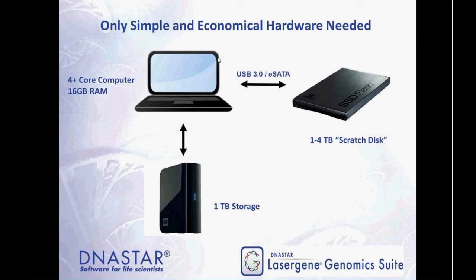Many customers opt for plugging in an external drive through USB 3 or eSATA. If you have an SSD drive, you get better performance. It reads data faster. So again, a computer like this might cost a couple thousand dollars, even under that, so you can get this very good performance on budget hardware.